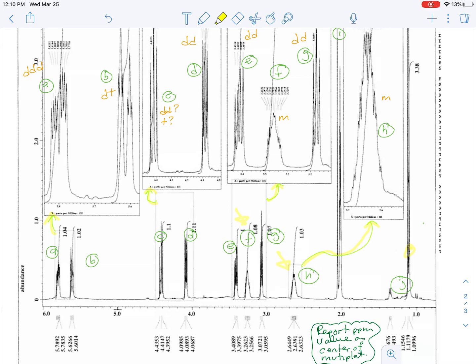To start, I followed the convention by lettering the signals from most upfield to most downfield: A, B, C, D, E, F, G, H, I, J.